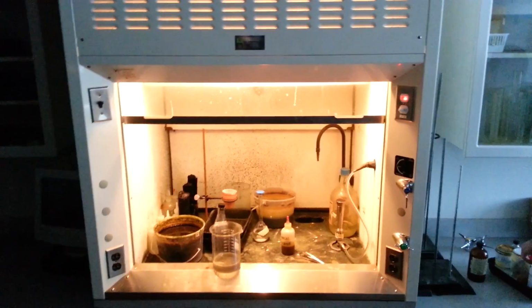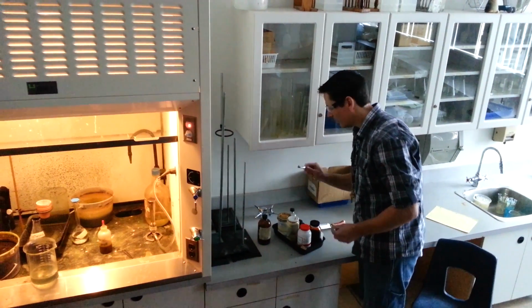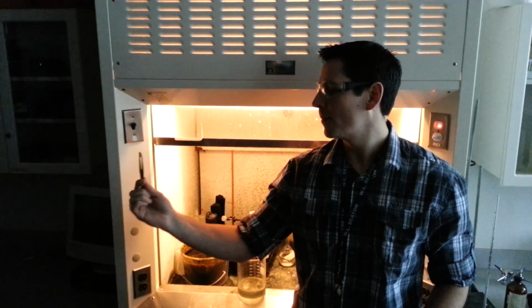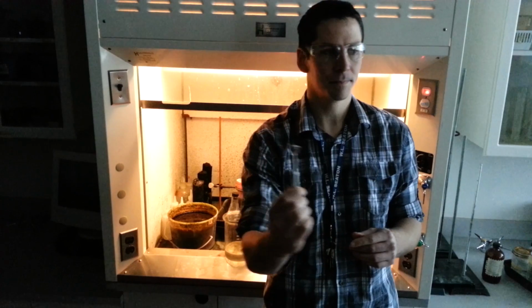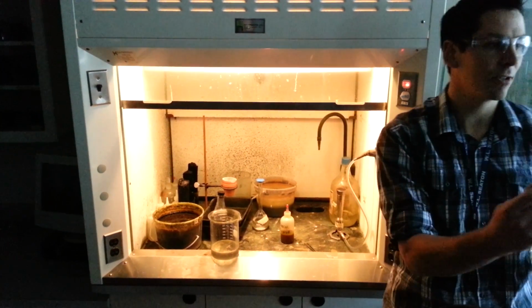Grab some sodium. And so here's the sodium. The side that's been exposed for a bit is a bit pinkish, a bit dull pink. And the side I just cut, it's nice and shiny. And it's a nice soft metal. And actually, as you get more metallic, metals do get softer in general, not harder.